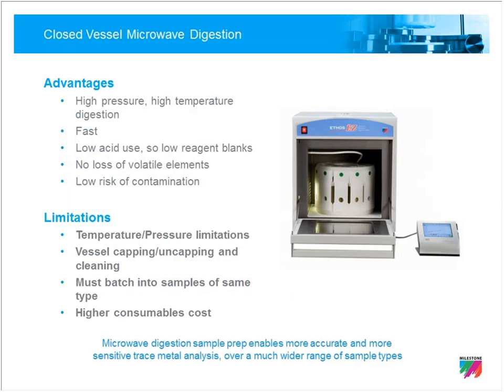So, coming back to closed vessel microwave digestion, it's going to be the primary closed vessel technique for USP 233 for all the reasons that I mentioned before. However, with traditional benchtop microwave digestion systems, and here you see our Ethos-EZ, I describe traditional benchtop microwave systems as using individual pressurized reactors inside of a large cavity, and these are available from all microwave vendors out there.